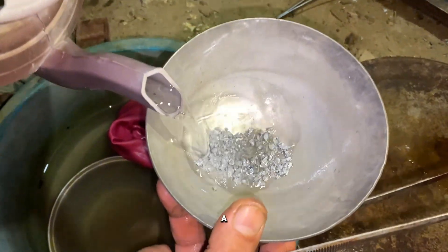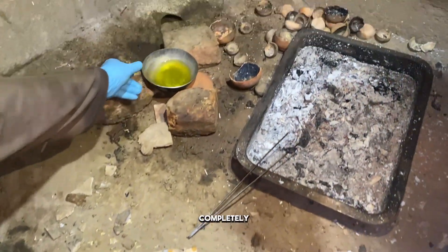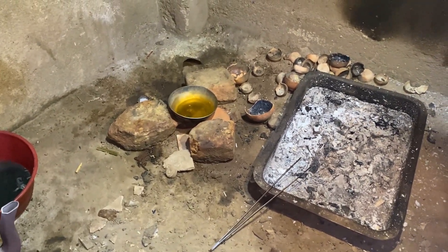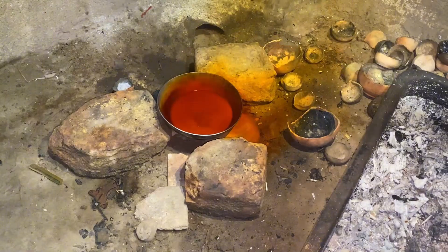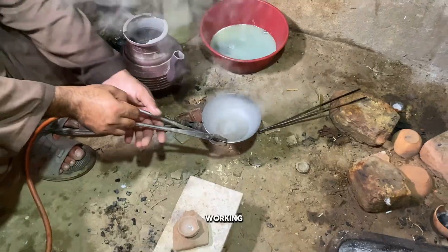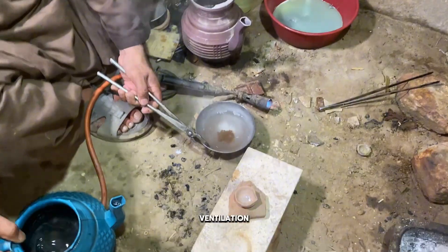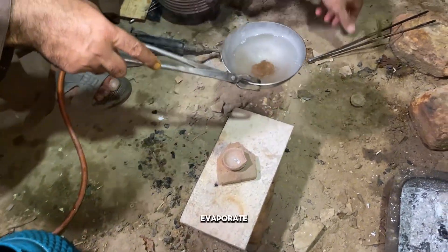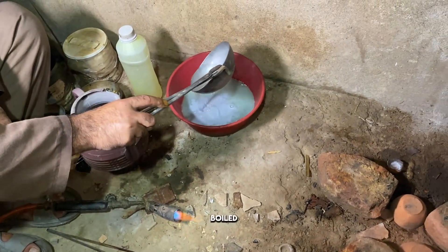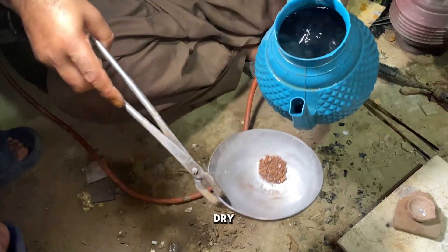To clean this, we'll add a little more nitric acid and heat it again. This will help remove the mercury completely. Be careful while working with mercury — always work in open air or with proper ventilation. Now the mercury will evaporate, and only pure, raw gold will remain in the filter. Once it's fully boiled and cleaned two to three times, we'll wash it carefully with water, then dry it completely.